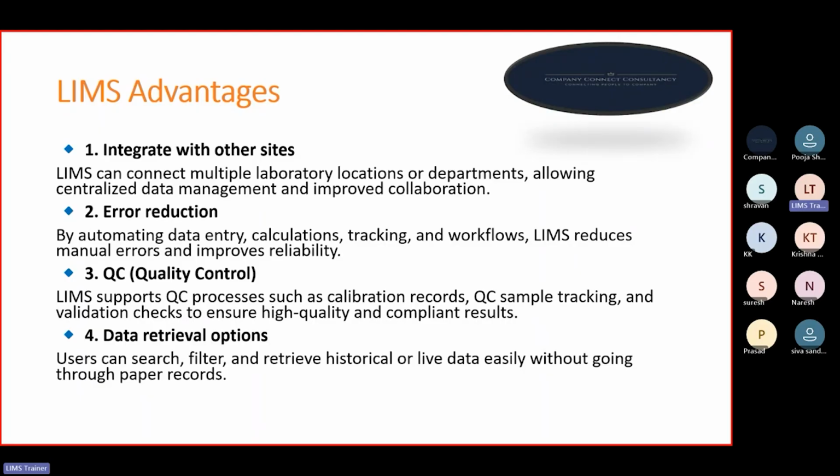That is why the analyst just needs to enter the results. They will have placeholders to enter the results, and the calculation will run behind the screen, and then they will get the results. So they don't have to do any calculation. They just have to enter the results, and the calculation will happen in the back, and then they will get the results.